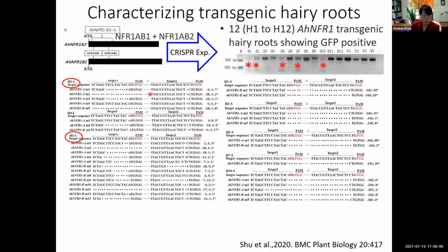In every single event, we have the genome edited on either target 1 or target 2, but for this one you can see there is no editing in these 2 columns on both targets, and these 2 are edited, which means that in this event, some of the cells, some of the fragments are edited, and some of them are not.